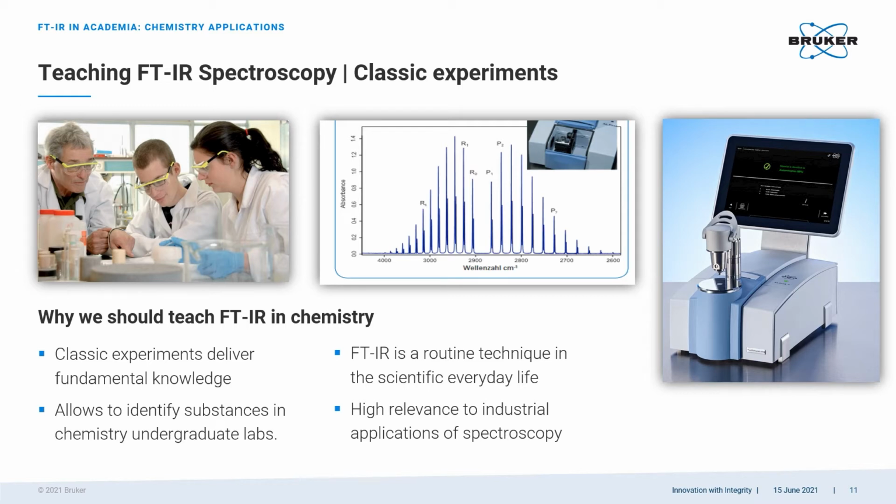less than a minute? And lastly, there is no other technique that has branched out into so many industries as IR spectroscopy. You can find FTIR spectrometers checking automotive compounds, polymer coatings, cement, gunshot residues, LEDs, OLEDs, semiconductors, microplastics, and I promise you, the list could go on forever. Whenever there is a need for a fast and simple chemical analysis, there is no way around infrared spectroscopy.